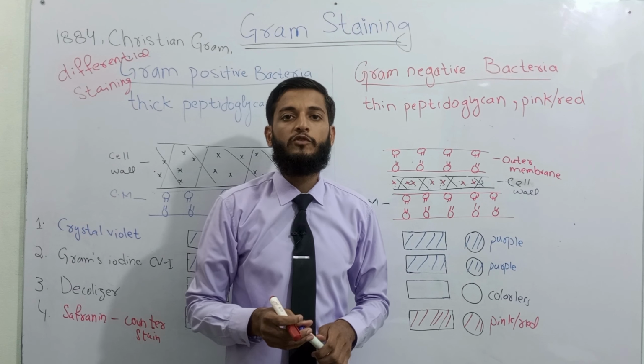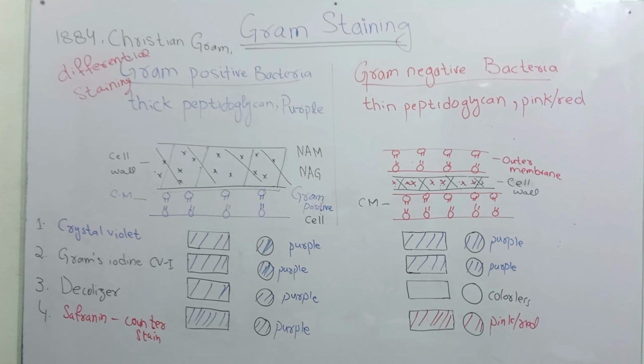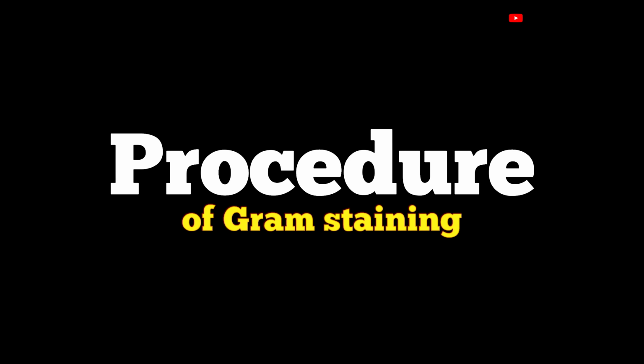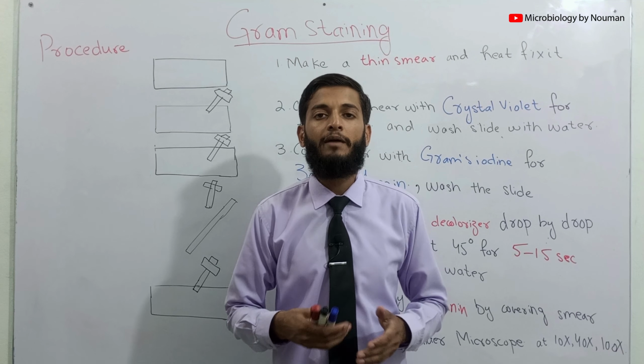Now we'll talk about the procedure for performing gram staining.